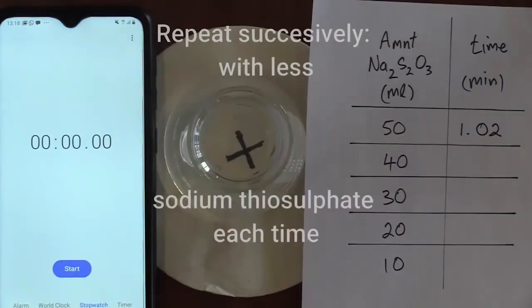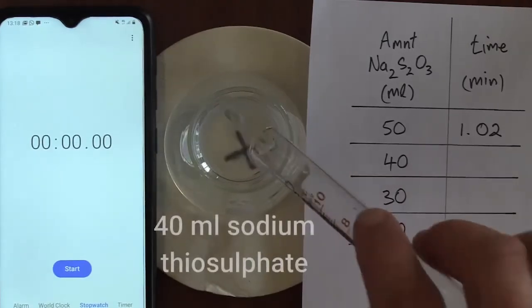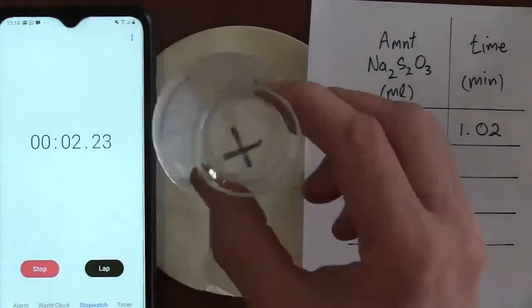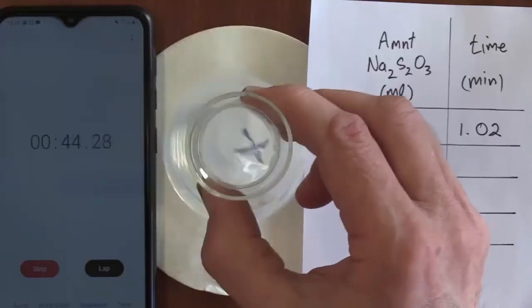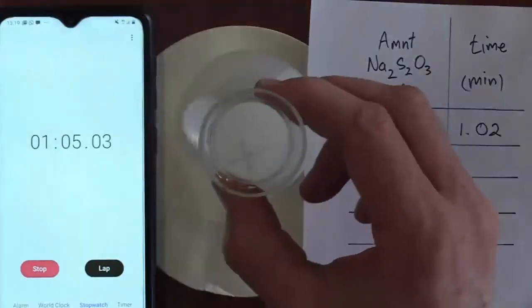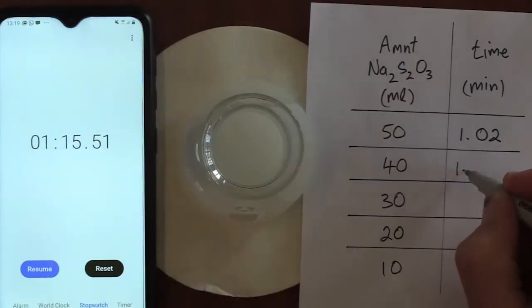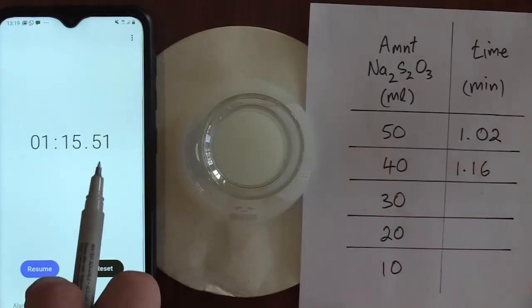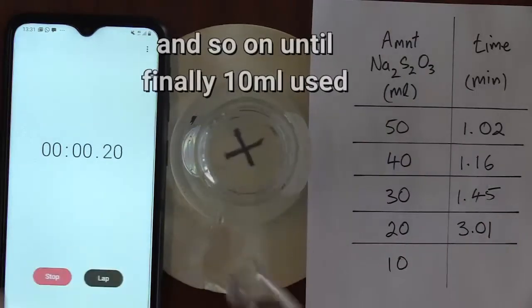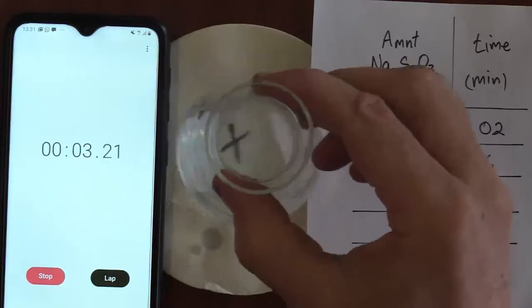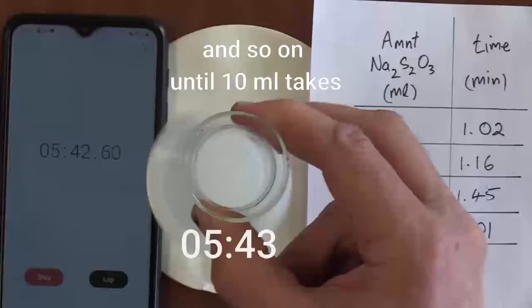We now repeat successively with less sodium thiosulfate each time. Here 40 milliliters. Again we speed it up and we notice the X is no longer visible at 1 minute and 16 seconds. We round the 15.5 one up to 16 seconds. And so on until finally we are only using 10 mils of the reagent. This takes 5 minutes 43 seconds.